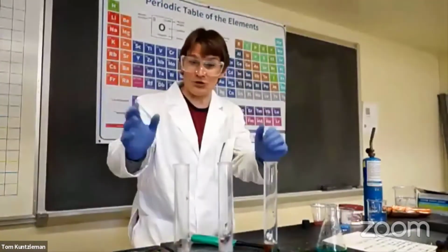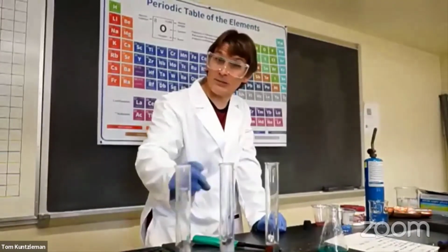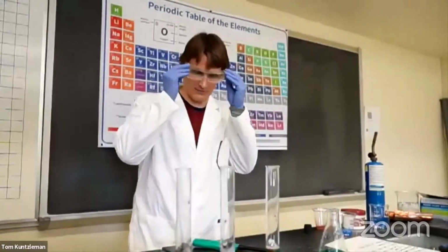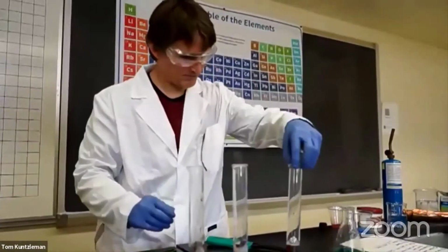And the green that you saw, that's just an indication that there's little tiny particles of copper being emitted as well, probably copper ion, just little tiny pieces of it. I love that experiment. That's a really interesting one.